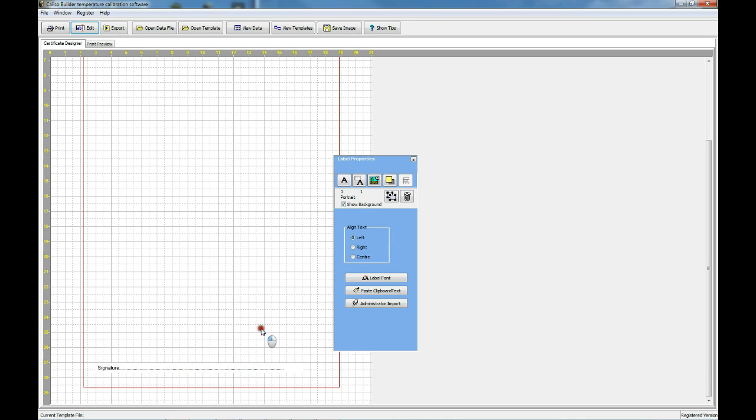So there we are. There's the static text box for print, and there is the box we're going to make for the date. So what we've got is name, and then date, as you would see, and these are normally placed at the bottom of a certificate. We're not going to overcomplicate this template just because it's for the purpose of illustration, but you can make them as complicated or simple as you need them to be, and the beauty of it is that you can save as many different templates as you need and use them as and when required.